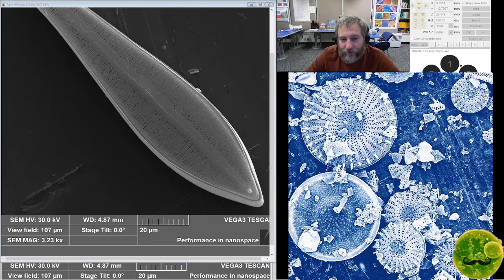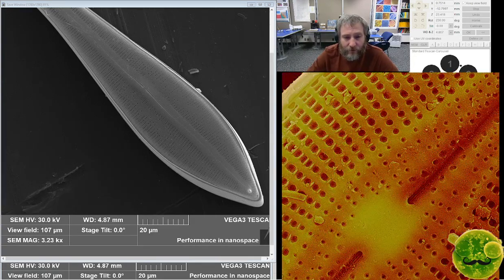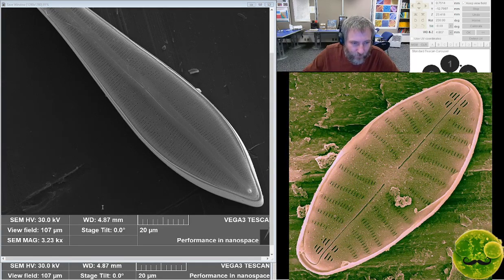And so together we're working on characterizing many of the diatom species in eastern Africa in these rift lakes, which are poorly understood. So this involves potentially describing new species and also redefining some of the existing species. Like this diatom currently is considered Gomphonema, but in reality it's probably not a Gomphonema. It's probably something else. And we're working on sorting out what it is exactly. So that's roughly what I'm doing.